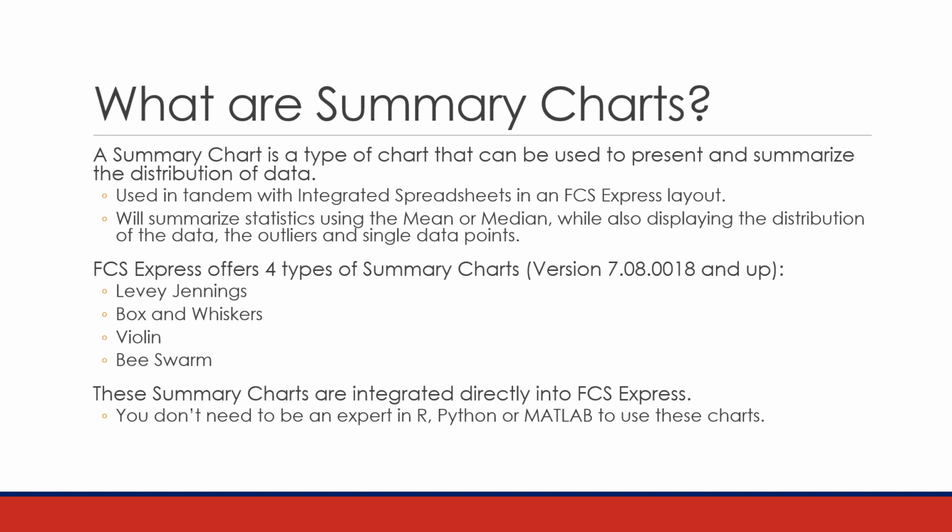The fact that we've integrated them directly into FCS Express means you don't necessarily need to be an expert in R, Python, MATLAB, or some of the other historical methods that people have used to create these charts. These are all integrated into FCS Express using the integrated spreadsheet, all looking directly at your data.